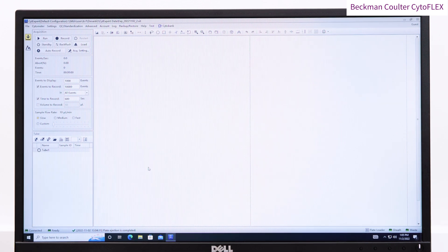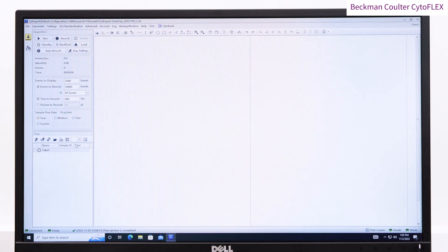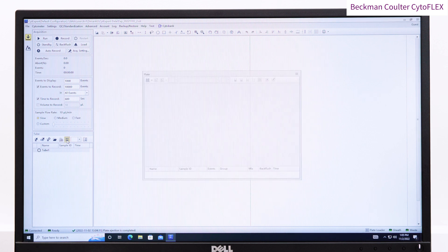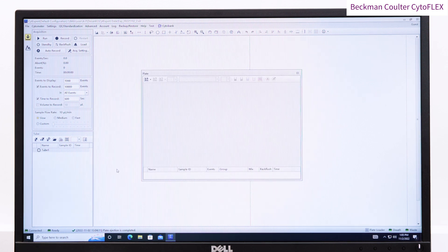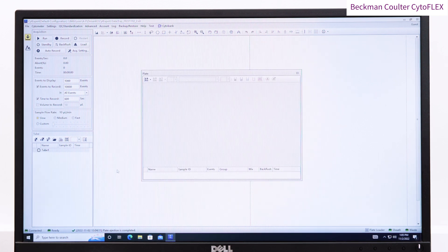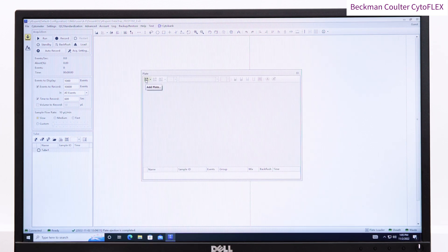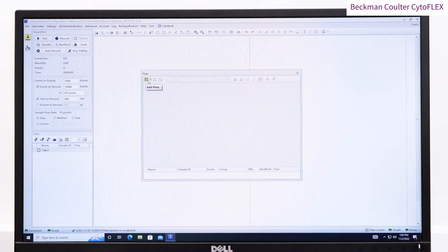So here we are going to do a new experiment in plate format. First I am going to choose the plate type, and you can choose the orientation. If you are running tubes, then simply click on new tube.